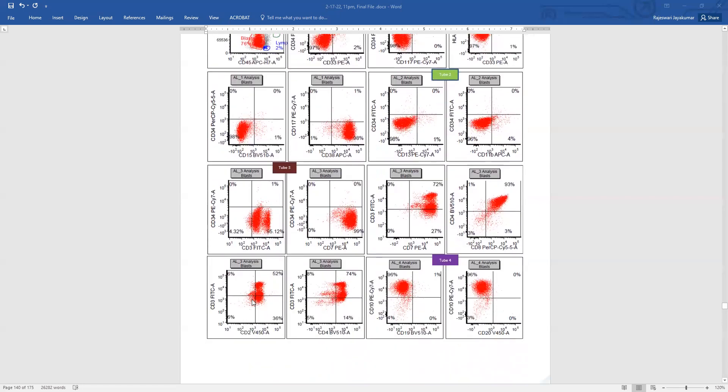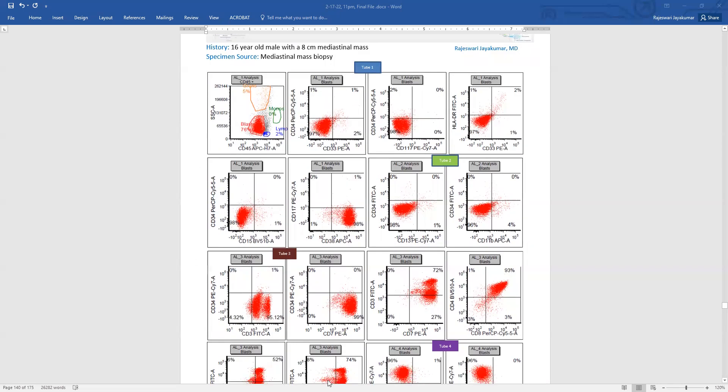They are also positive for CD2. And they are positive for CD10, negative for the B cell markers, CD19 and CD20. So it's pretty straightforward. This looks like the T cell lineage blast. But if you go again and look into the plots, we do not have any immaturity markers so far.